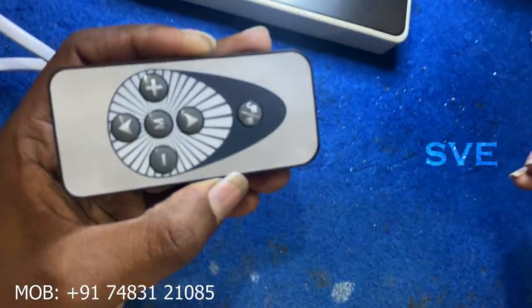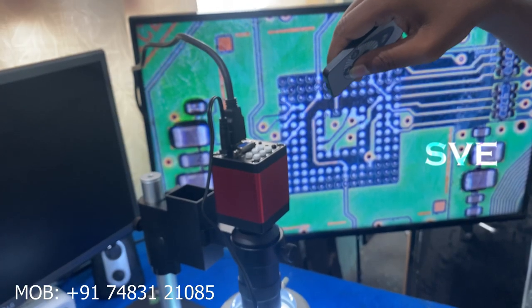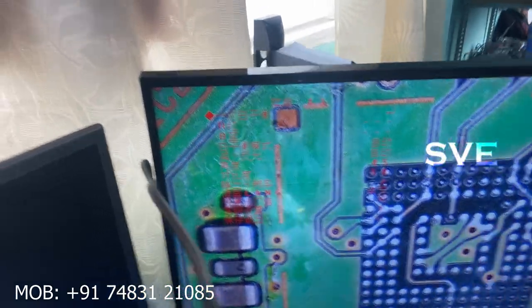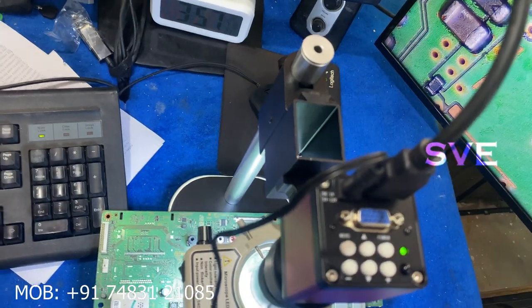This is the remote. There is only a menu working here, and it will be showing in some Chinese language, so I couldn't read that.